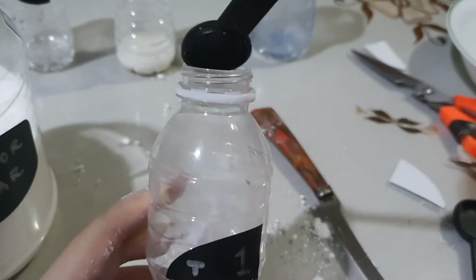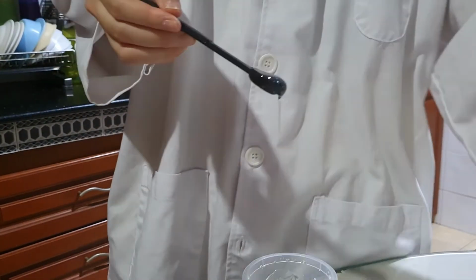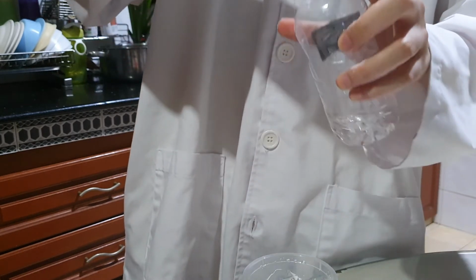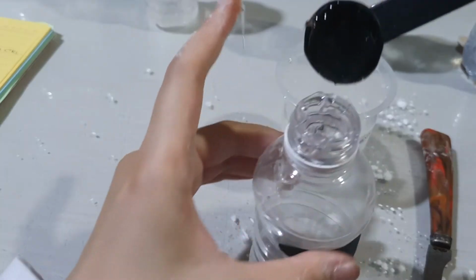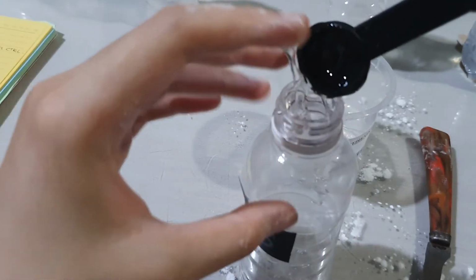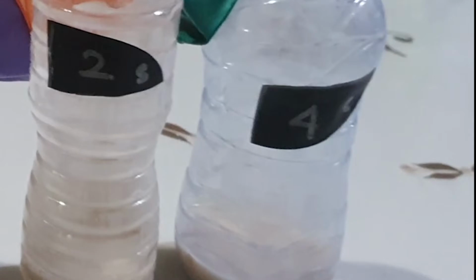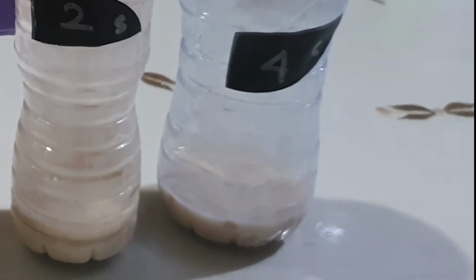Bottle 1 is table sugar, bottle 2 is cornstarch, bottle 3 is for glucose syrup. This process was quite messy because the spoon was too big and the opening on the bottle was too small. Glucose syrup is the hardest to work with because it's very thick and viscous, but I managed. I did not add any carbohydrate sample into bottle 4 because it acts as a controlled sample.